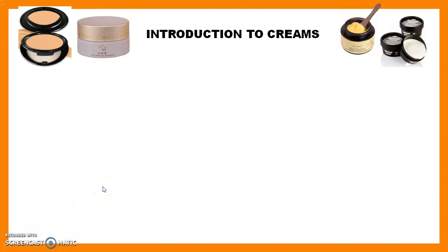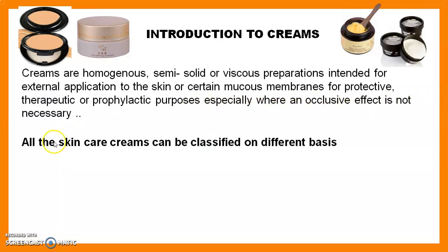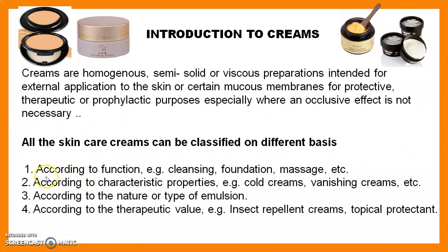Now we see the theory regarding the creams. Creams are homogeneous, semi-solid or viscous preparations intended for external application to the skin or certain mucous membrane for protective, therapeutic or prophylactic purposes, especially where an occlusive effect is not necessary. All the skin care creams can be classified on different bases. First of all, according to the function, for example cleansing cream, foundation cream, massage cream. Then according to the characteristic properties, for example cold cream, vanishing cream, etc.